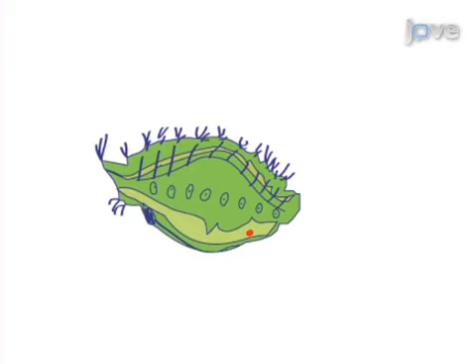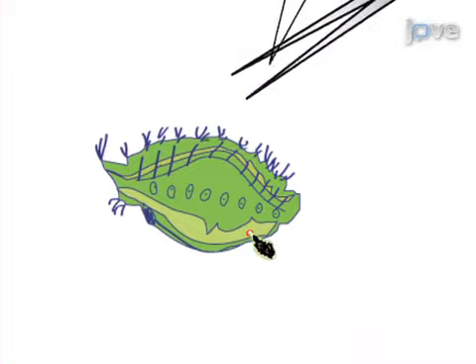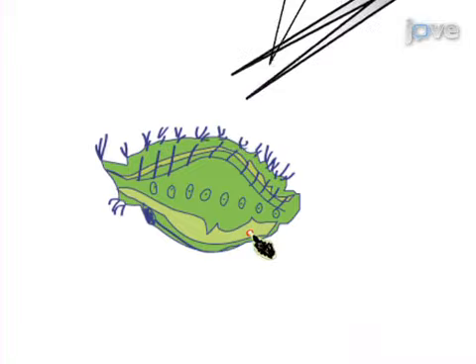Next, the caterpillar is gently squeezed using soft forceps, then the buffer solution hemolymph mix is aspirated using a micropipette and collected in a microcentrifuge tube.